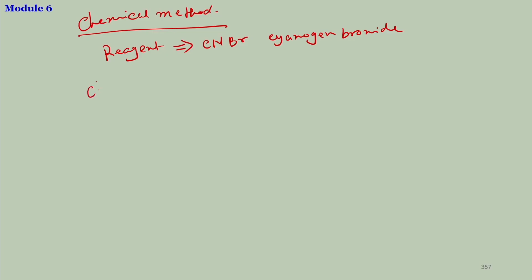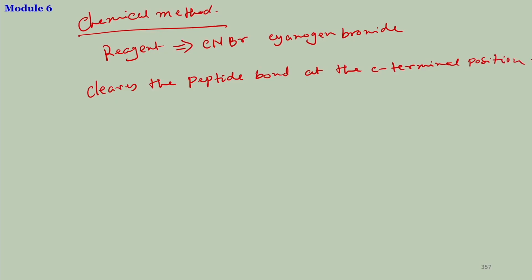So, this again cleaves the peptide bond at the C terminal end, or C terminal position, of a specific amino acid, in this case methionine.